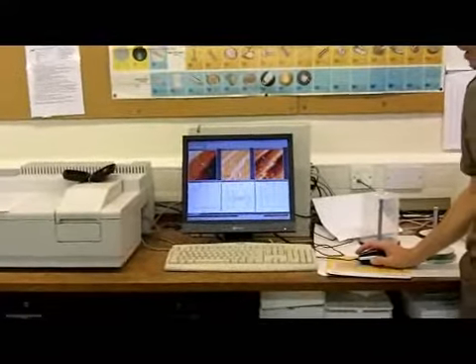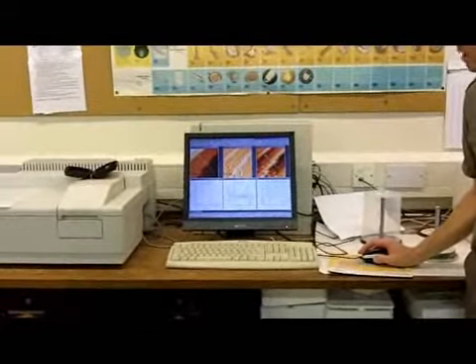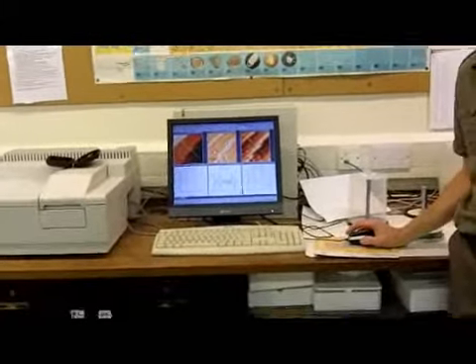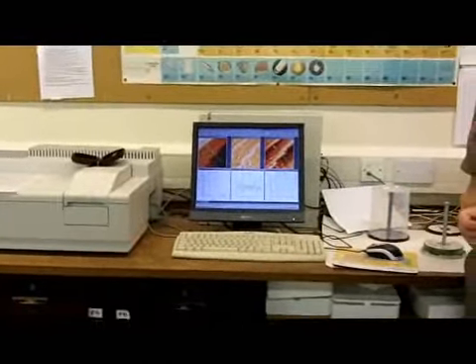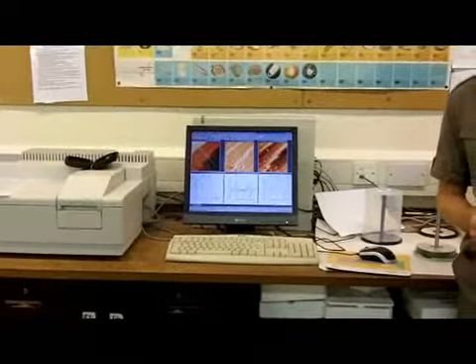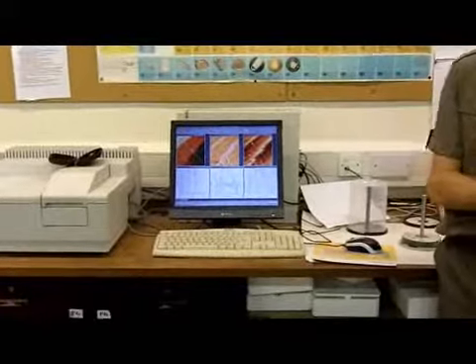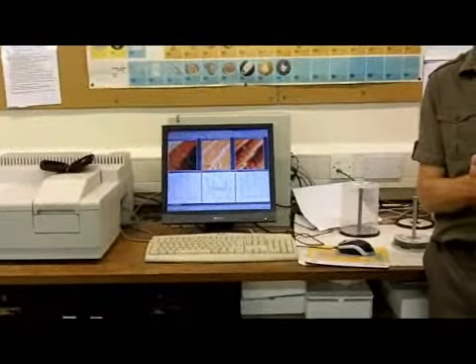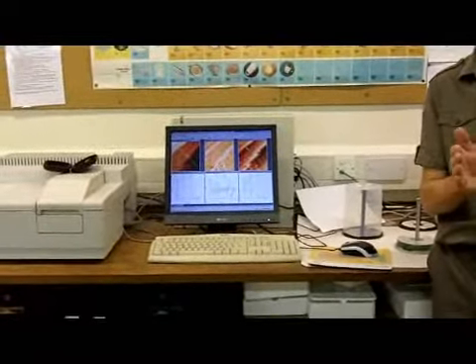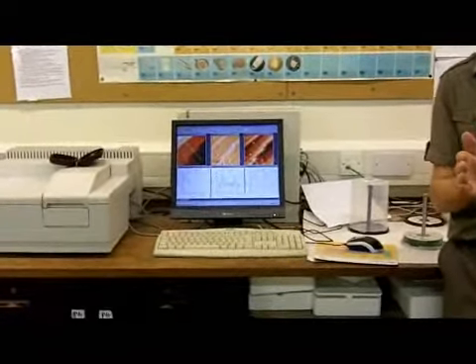Okay, now, one other tip about measuring distances on here. These images are recorded point by point, and that means you don't have a huge number of points. You've got 250 square points. What that means is that if you measure the distance between 2 points and your cursor moves by a bit, you might well see a big difference in your measurement. So single measurements aren't very good. What you want is an average.